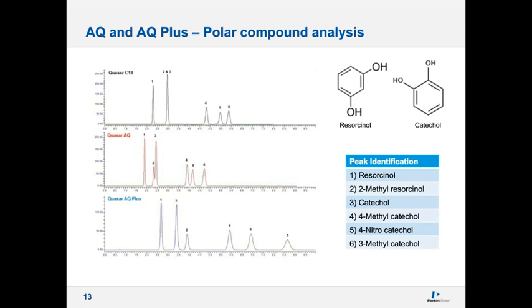Compounds 2 and 3 have achieved more than baseline resolution, and there is greater resolution between compounds 4, 5, and 6. The elution order has also altered, and much greater retention has been achieved. The runtime could be reduced by altering the mobile phase composition too. It is, however, necessary to define the goal of your screening and the attributes of your desired method. For example, is the goal to have a quick screen to know instantly which column you should move forward with, or is it more of an investigative screen to determine the potential of these phases? In this case, the AQ Plus gives baseline separation straight away. However, the AQ column provides the shortest runtime and also provides scope to optimize.